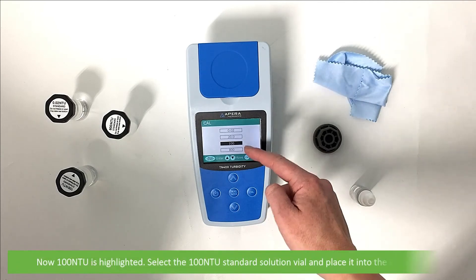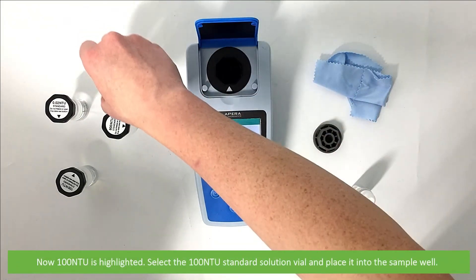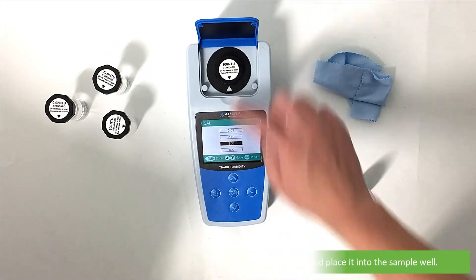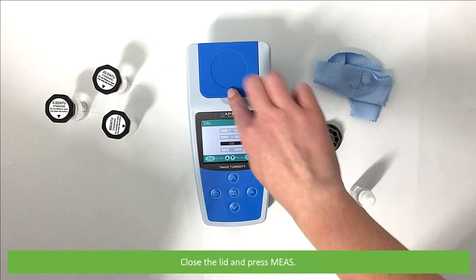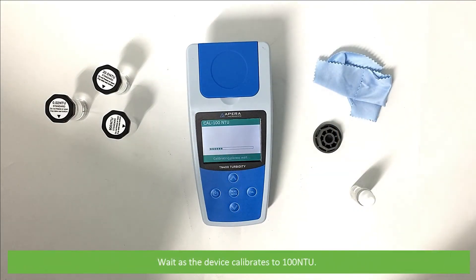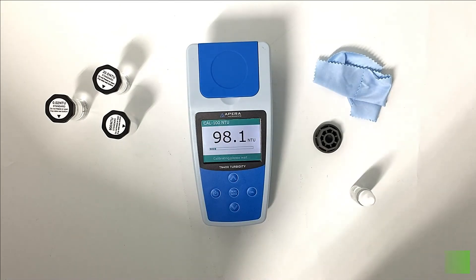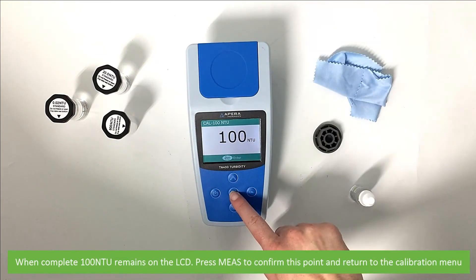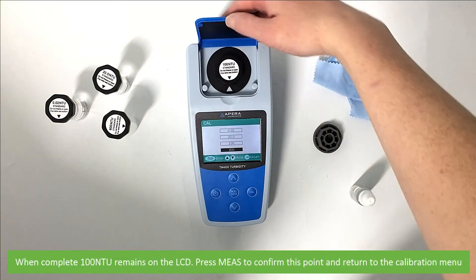Now 100 NTU is highlighted. Select the 100 NTU standard solution vial and place it into the sample well. Close the lid and press measure. Wait as the device calibrates to 100 NTU. When complete, 100 NTU remains on the LCD. Press measure to confirm this point and return to the calibration menu.